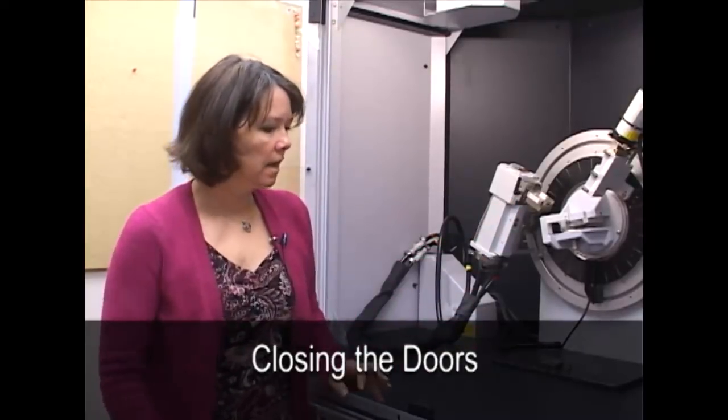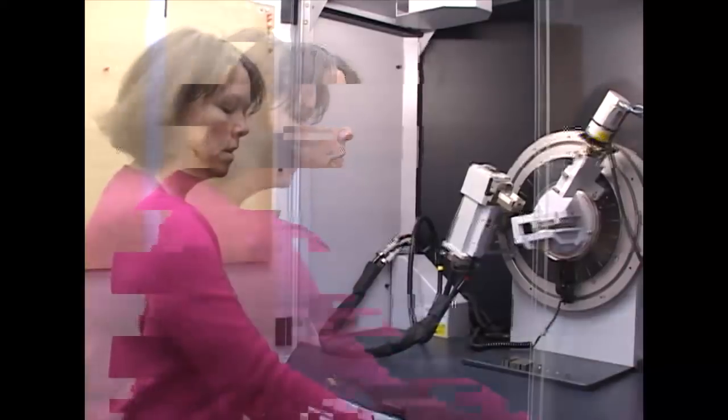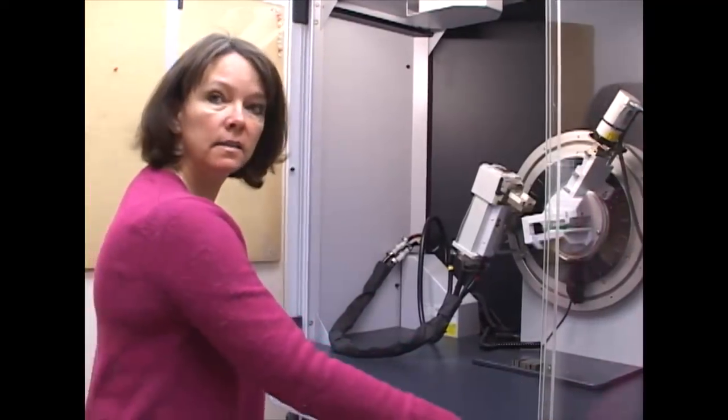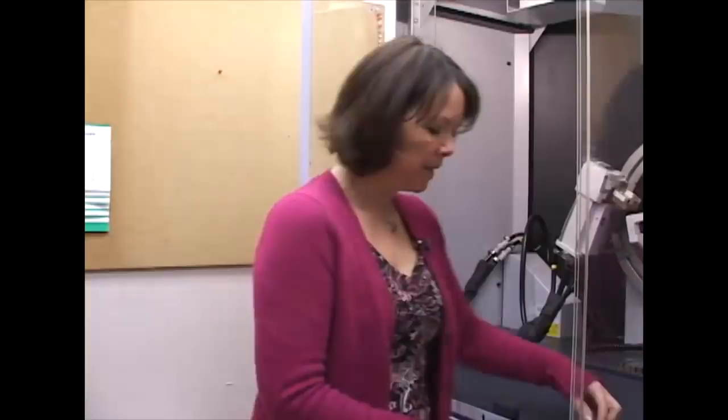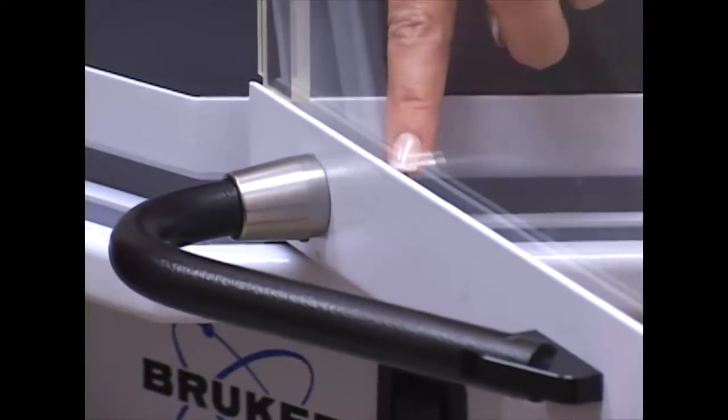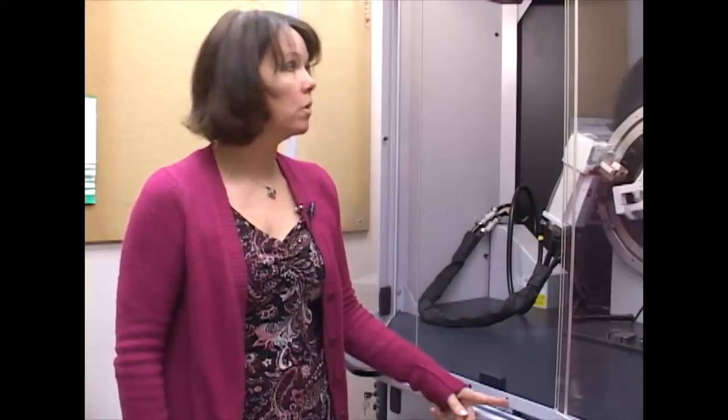Once your sample is loaded, you can close the doors. The doors are leaded glass and are part of the safety circuit in the instrument. So we are generating x-rays and those are radiation and could be dangerous. Radiation doesn't travel very far, it doesn't travel through thick objects and it doesn't travel through lead. So these are leaded glass and they have little pins in the handles that will engage mechanical switches in this, right in here, in the door.